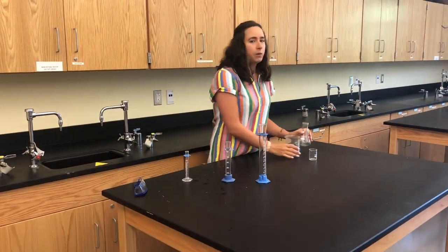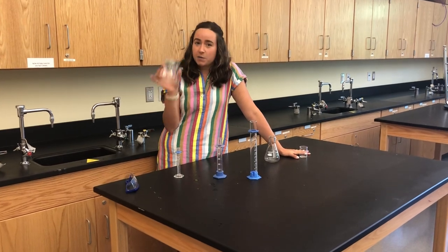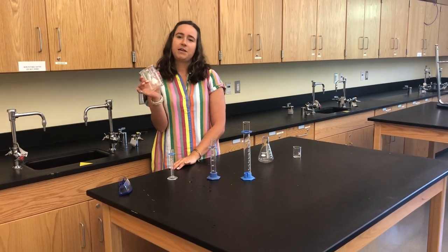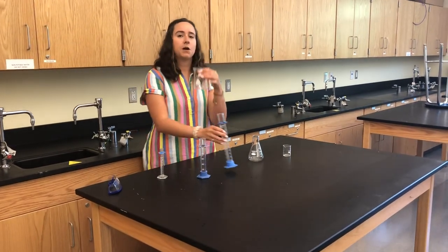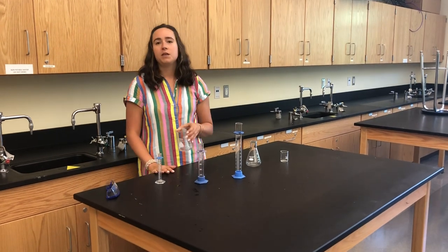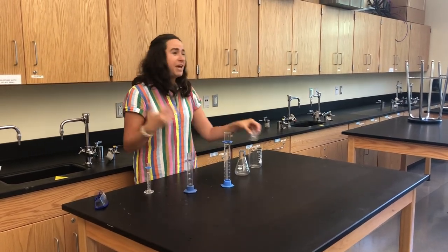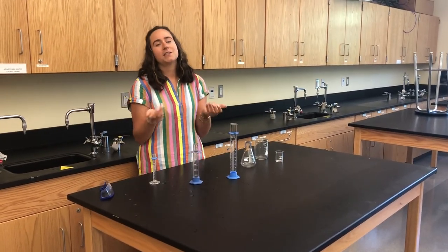The next two pieces of glassware are where we hold our liquids. First is the beaker — I do not want to see you measuring volume in a beaker because it's a lot less accurate; it doesn't have as many graduated markings. We use beakers more for holding liquids: once you've measured out your volume in the graduated cylinder, you pour it into the beaker. Sometimes we heat it over the Bunsen burner or mix different liquids together. We have multiple sizes, from small 50 milliliter beakers to ones that hold up to a liter.